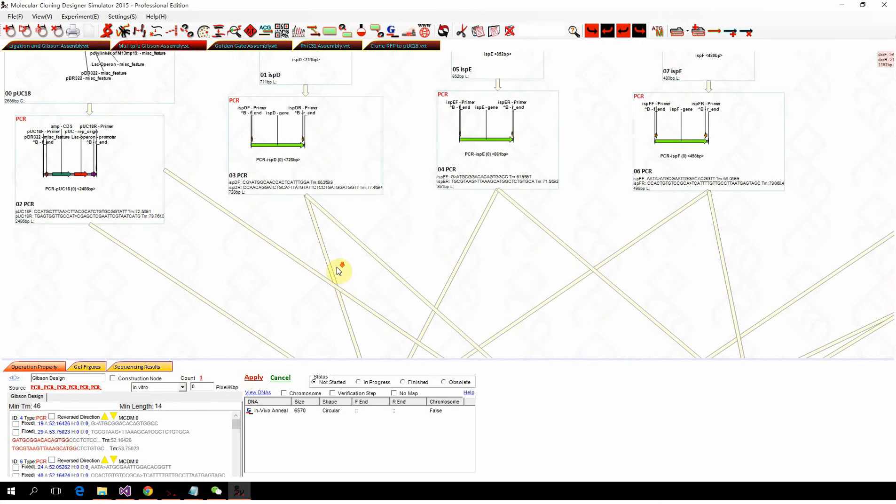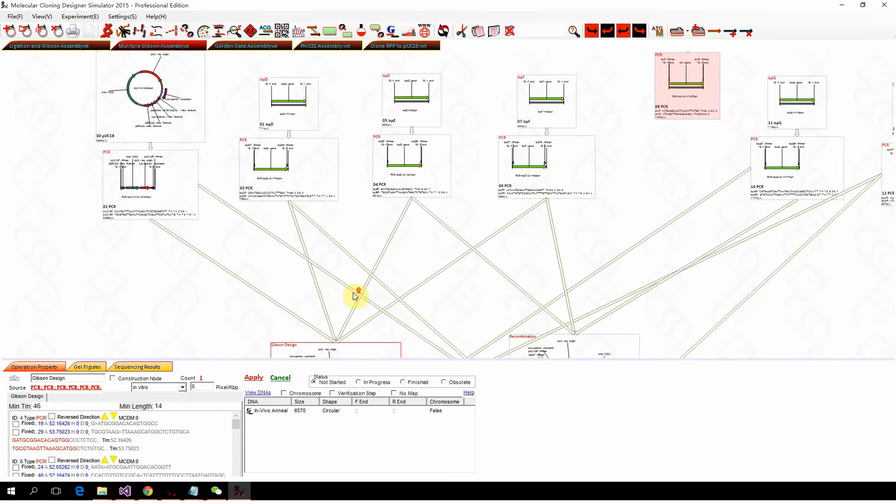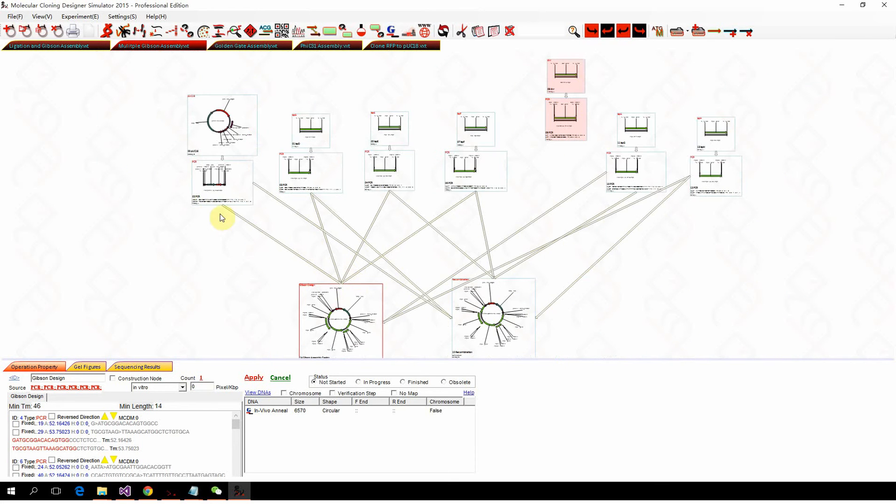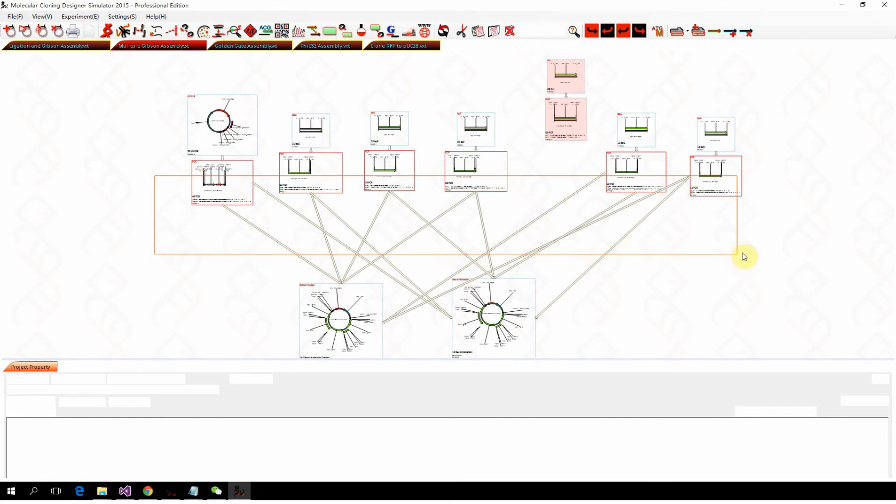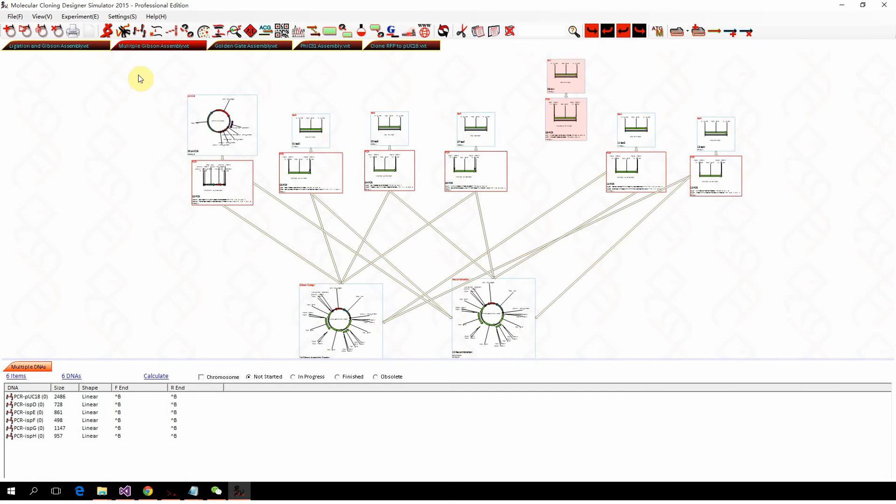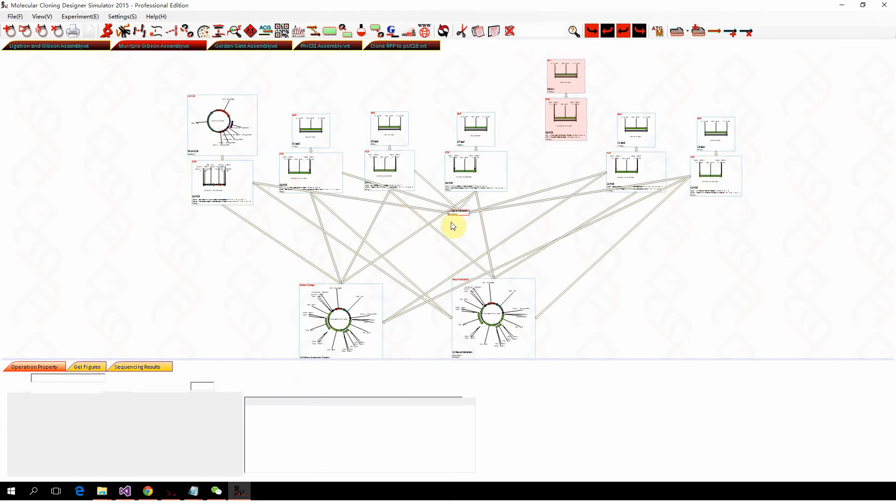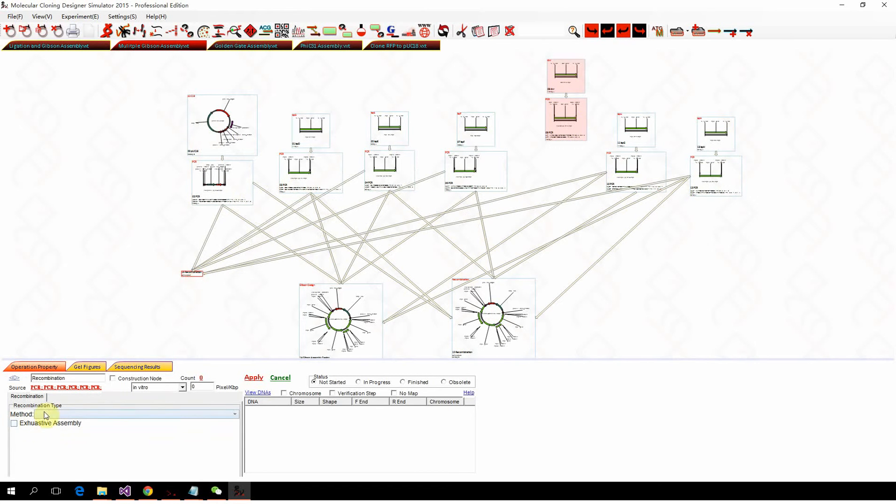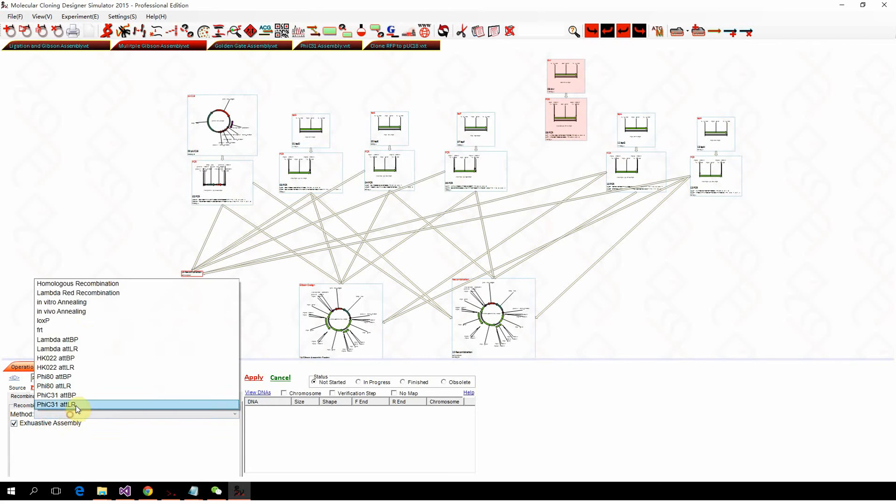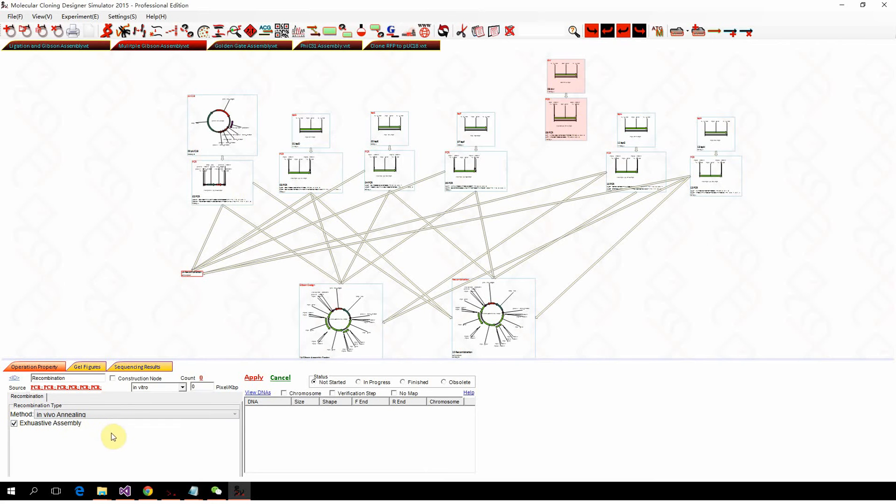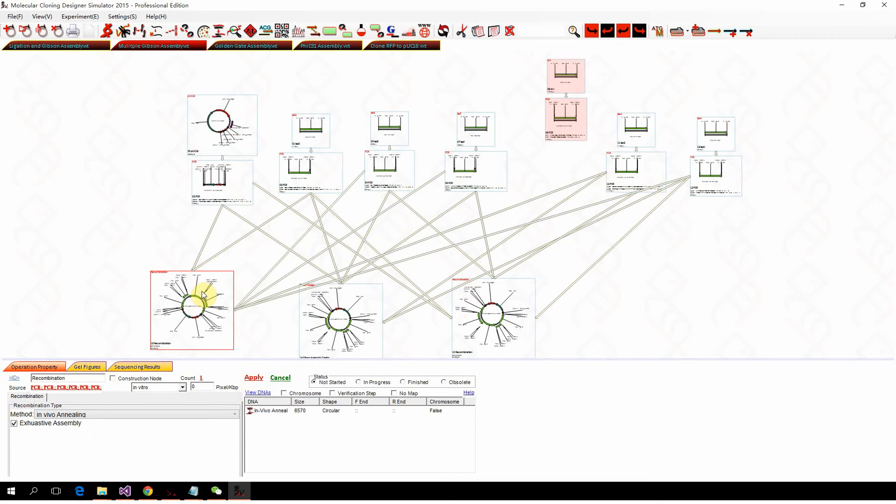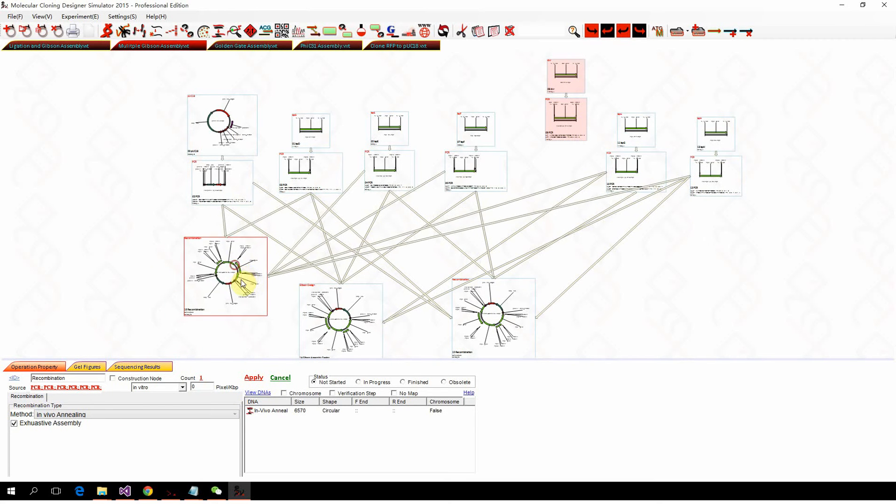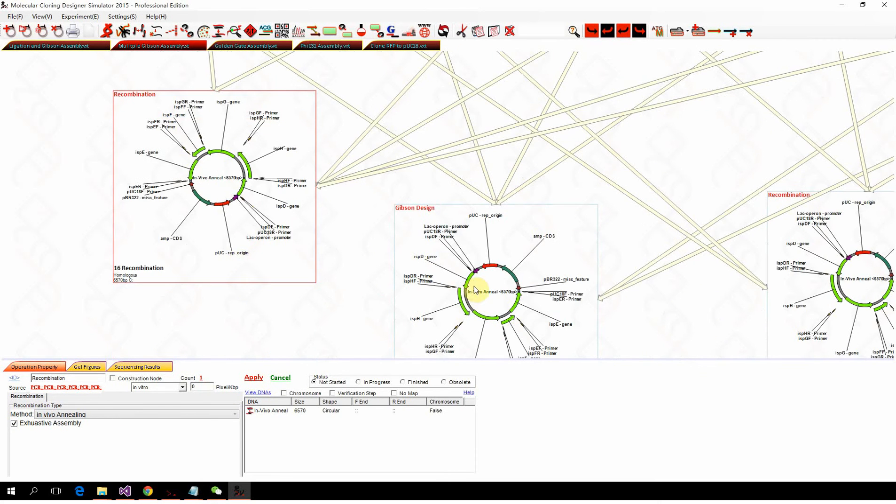We can assemble six fragments together, so we can simulate this again with the recombination, here exhaustive and in vivo annealing mode, apply. It's actually the same thing.